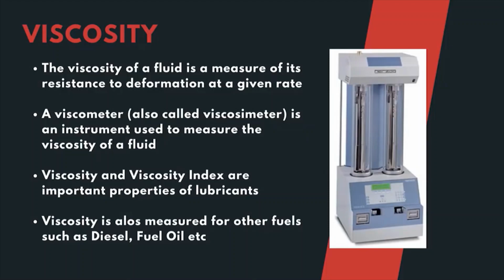Viscosity is an important property that is being tested for most of the petroleum fractions. The viscosity of a fluid is a measure of its resistance to deformation at a given rate. In order to measure the viscosity of a petroleum fraction, a viscometer or a viscosimeter is used.